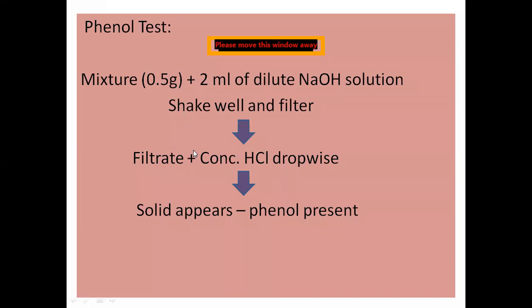So you will not get the liquid phenol. And you have the solid mixtures only in this semester. There are cresol, there are liquid phenols, but generally for the students they do not give them. So normally here it is solid mixtures.